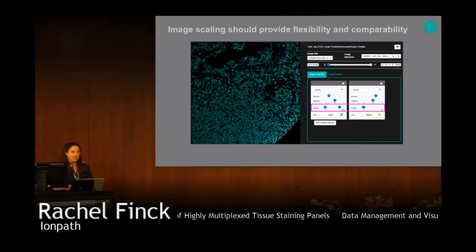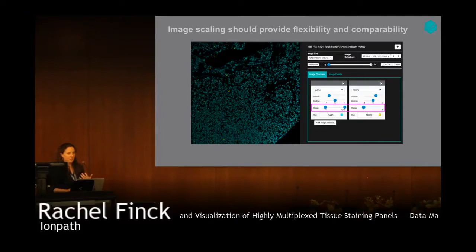Once you get into this higher dimensional stuff, where you want to be able to highlight different channels and switch between them real fast, just making that interactive and intuitive for these QC checks matters. If you're giving data to a pathologist who's never worked with this particular technology before, just making it quick for the interaction.